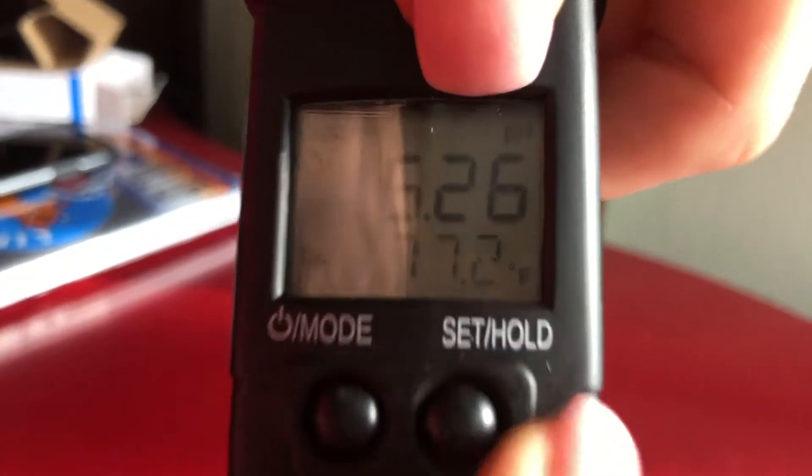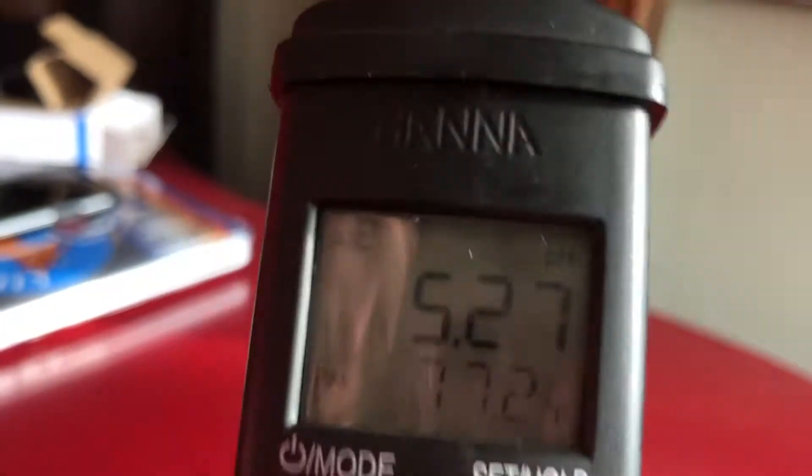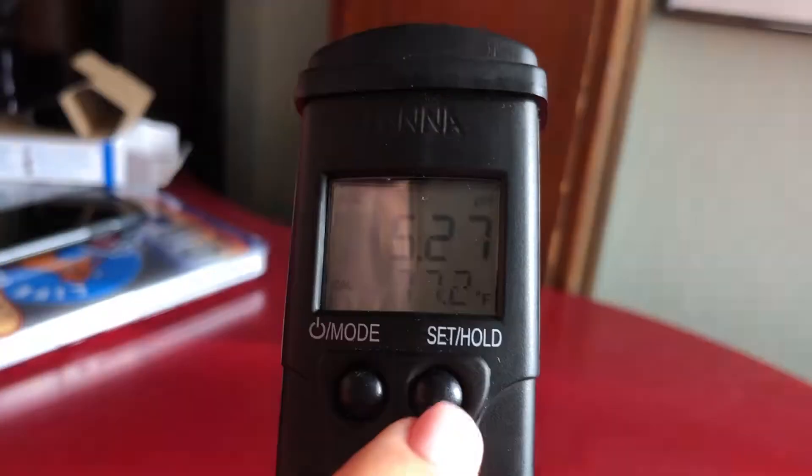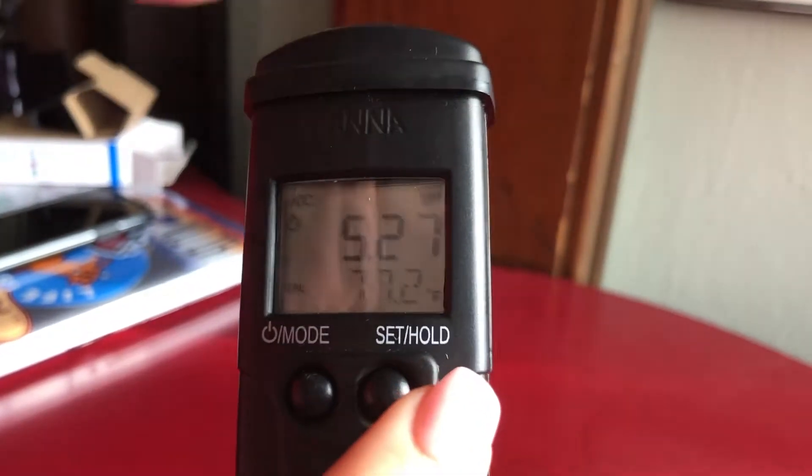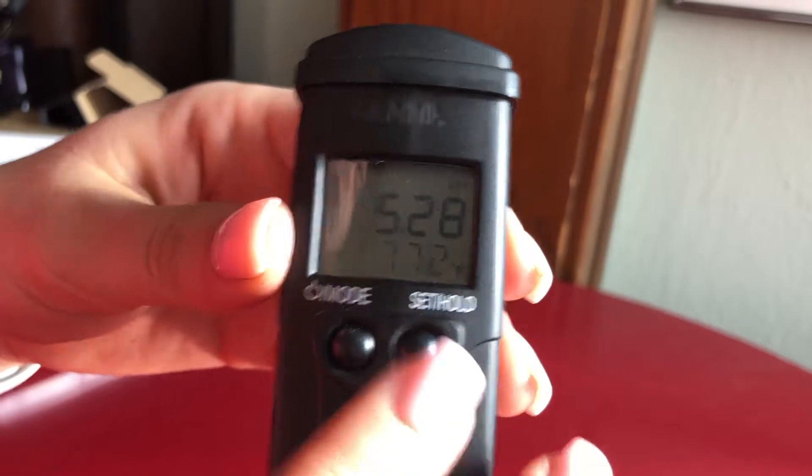Make sure that pH is selected in the upper right-hand corner. If it's not, press and hold the button and it'll switch you between the measurement modes. Make sure you're on pH.